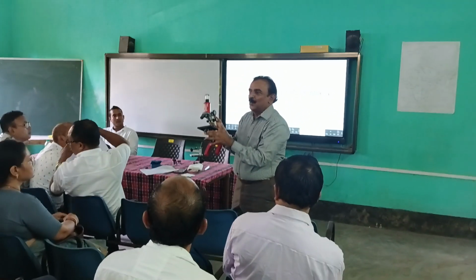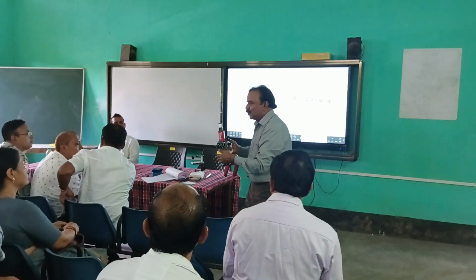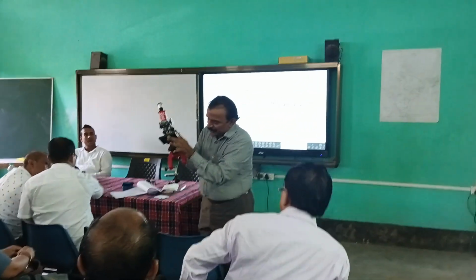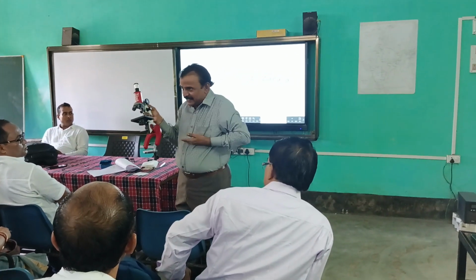But you are not opening it. Simply, it is closed, and if you want to watch any microbe, you cannot see. Why, madam? What is the reason? Here, what is that? The lever is there, and this is called the diaphragm.